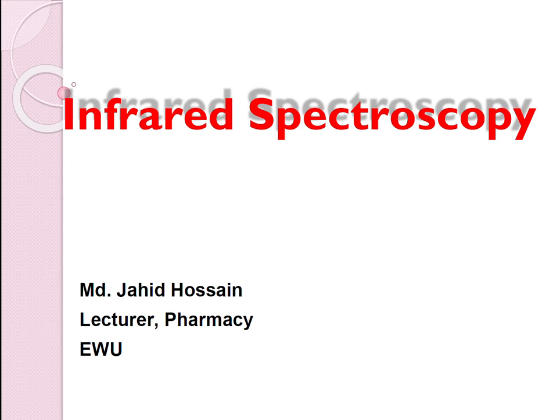Dear everyone, in today's video lecture, we'll be learning about infrared spectroscopy under the course of pharmaceutical analysis. So let's start.